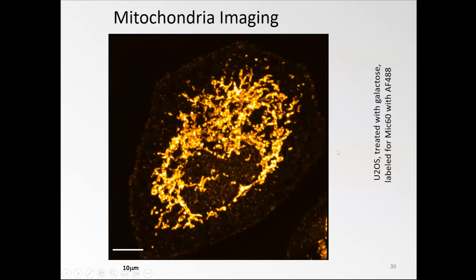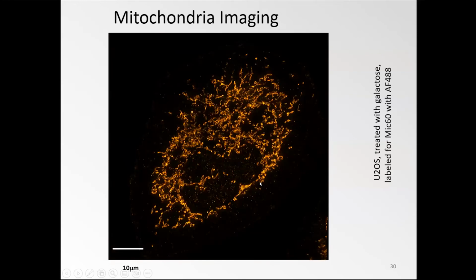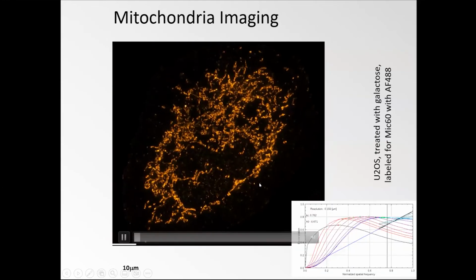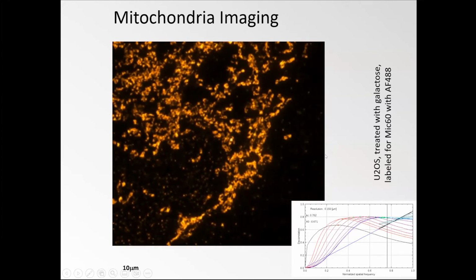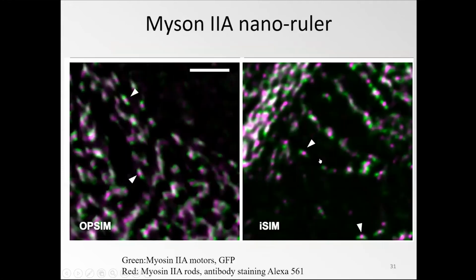All right, let's maybe skip over that. I was just looking that it also works in a cell, and it gives you also with some decorrelation analysis a value around 150 nanometer. Let's just go a bit quicker.